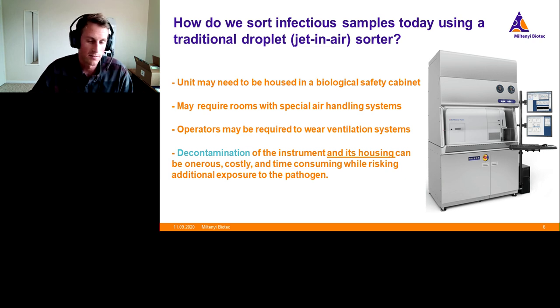If anyone has spent a lot of time with this type of cell sorter, you know that a clog that goes through can spray material all kind of inside the device, which poses an outrageous amount of work to get that clean. And that's a person who has to go in there and do that cleaning. So under those circumstances, somebody's having to either take on that risk or be abundantly cautious when cleaning out these systems.